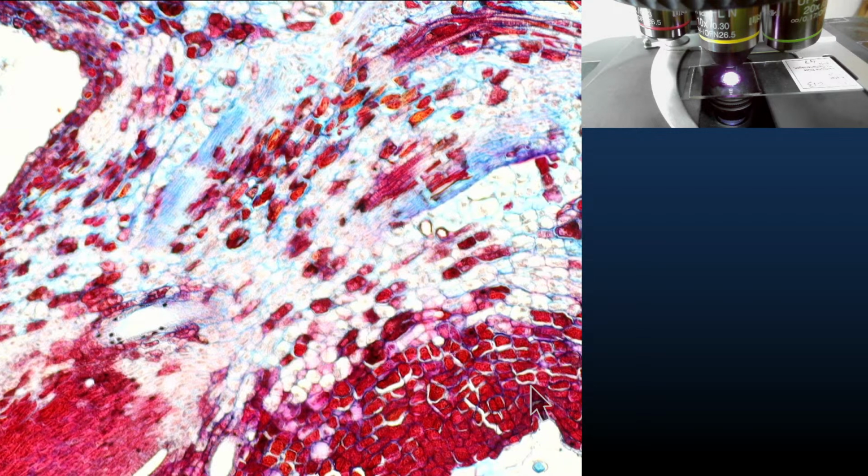Can we see an opaque object with a compound microscope? Because I'm interested in collecting micrometeorites. Yes, you can do that with a low magnification by using a strong flashlight from the top.